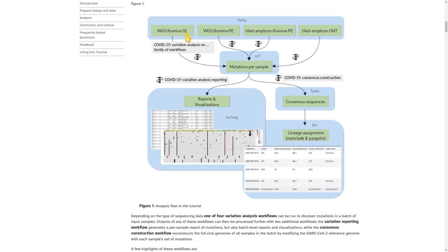The workflows at the core of this analysis: one of these four workflows goes from raw sequence reads to mutations called per sample. Because we're following along with the suggested example data, the workflow we're going to use is the one for Tiled Amplicon Illumina Paired-end sequencing data. It will result in a collection of VCF datasets that holds those mutations per sample in the batch.